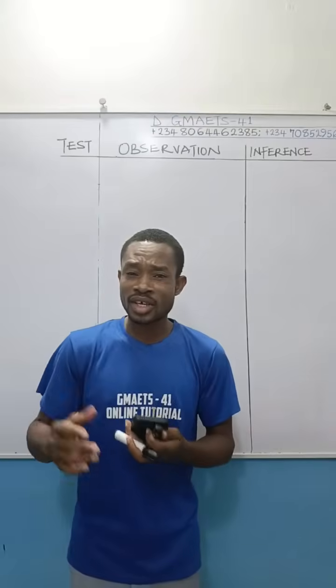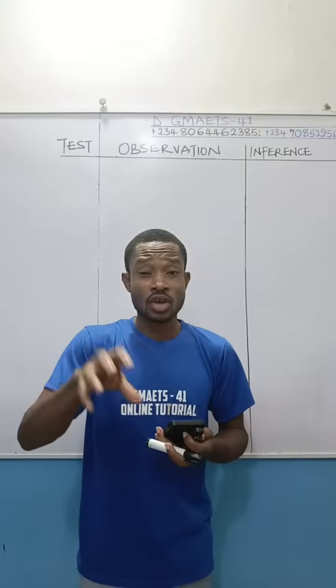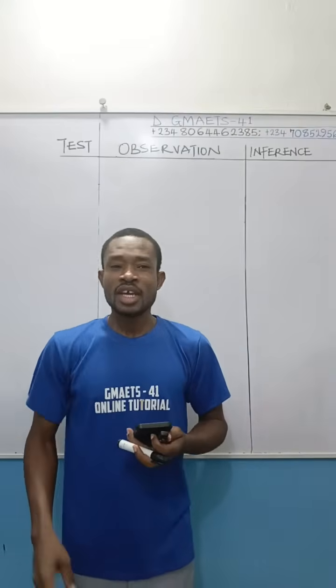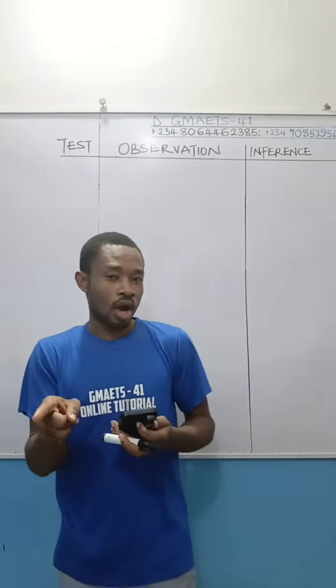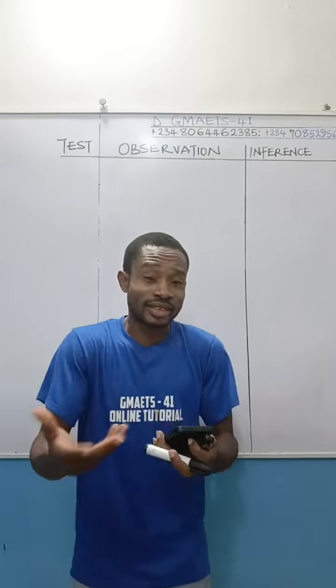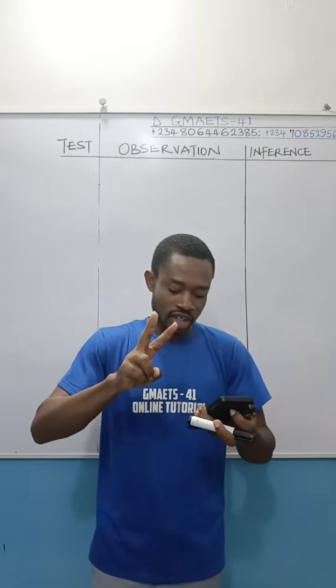What is there? And other things. Already your background knowledge, theoretical knowledge of all these color changes will already help you to know what you are testing for. If what you're expecting does not show up, it now means that the ion you are suspecting is absent in that case. So these are two key points you want to give attention to.